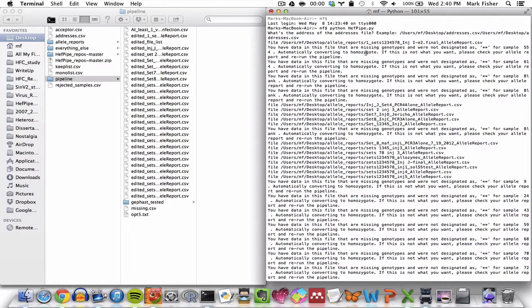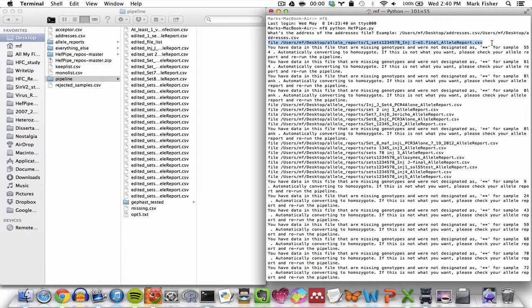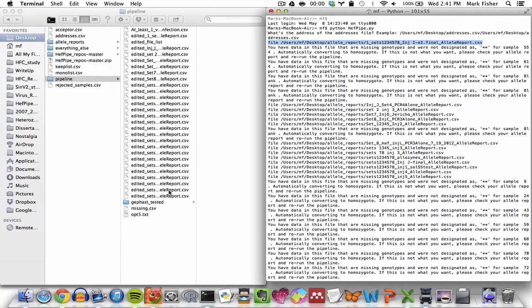So the pipeline outputs a lot of things. The first thing is the name of the first allele report being processed. You can see that here. Now if the allele report contains missing data that are not designated with two asterisks, it will inform you which sample or samples bear the missing data. Now this process is going to repeat for each allele report in the allele reports directory and you'll notice that as each allele report is processed, a corresponding edited allele report is going to appear in the pipeline directory.